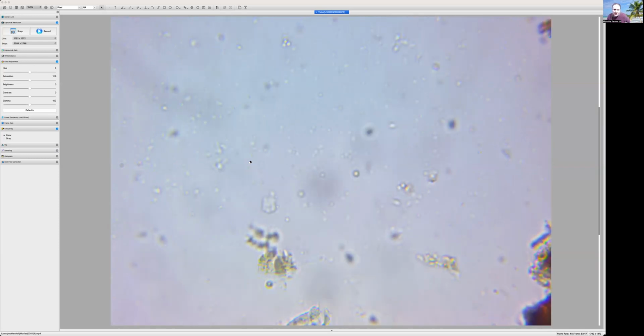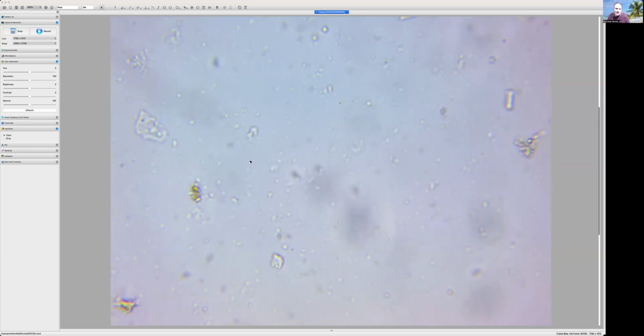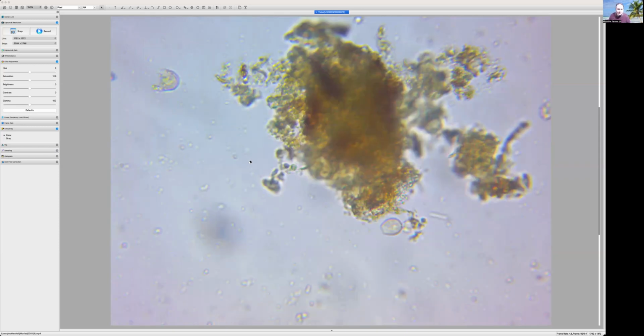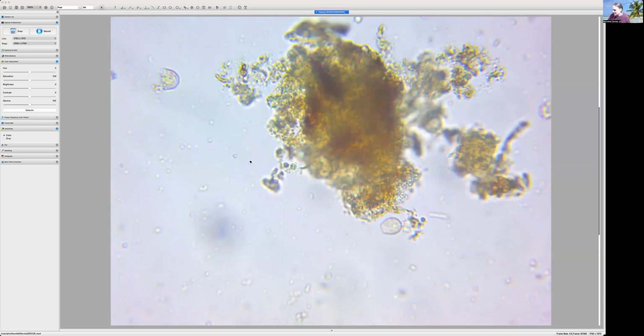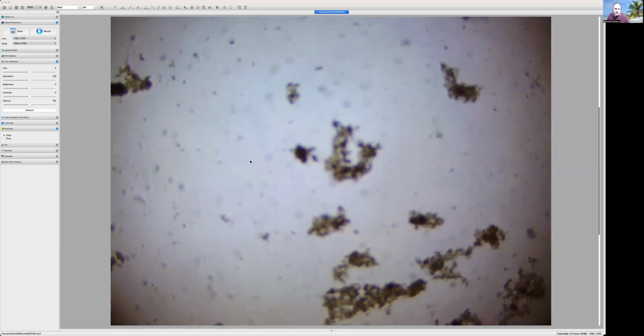See, I can keep watching and keep watching. There's some testatomoeba. More testatomoeba. Okay, let's back out again. And one more time at the 40 total.